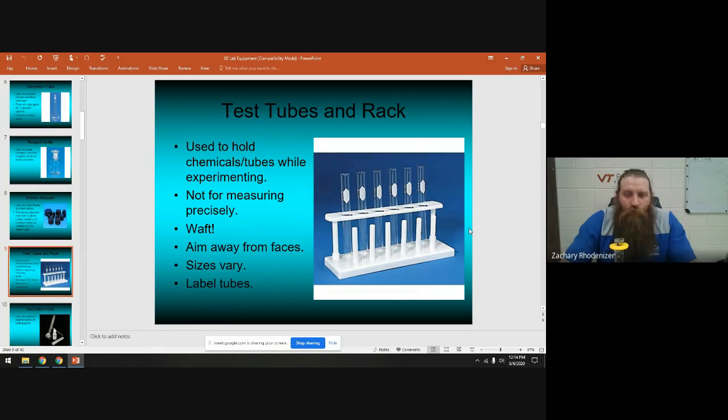Test tubes are pretty standard — the test tube rack holds them. Remember, test tubes are not for measuring; they're for doing your experiment. You can use them to waft chemicals. Whenever you heat them, make sure they're pointed away from all faces at an angle — never heat directly from the bottom, always tilt to one side. Make sure you label your test tubes. Once washed, flip them upside down on the rack's little sticks to help them dry.